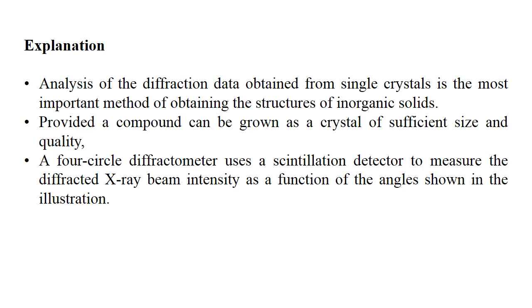The collection of diffraction data from a single crystal is normally carried out by using a 4-circle or area-detector diffractometer. A 4-circle diffractometer uses a scintillation detector to measure the diffracted X-ray beam intensity as a function of the angles shown.